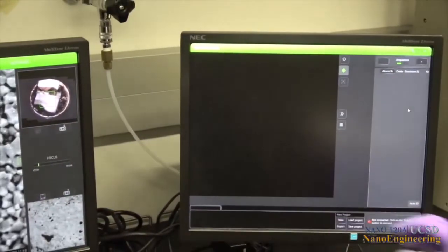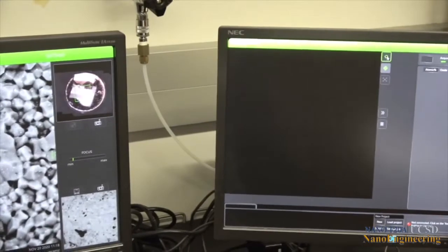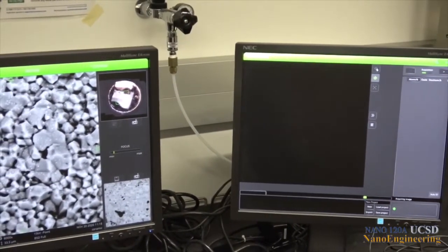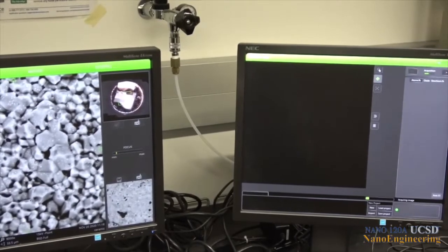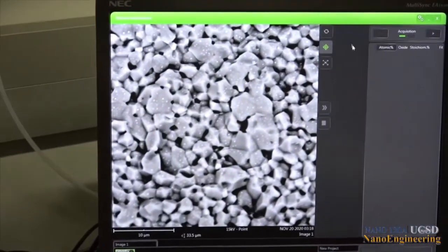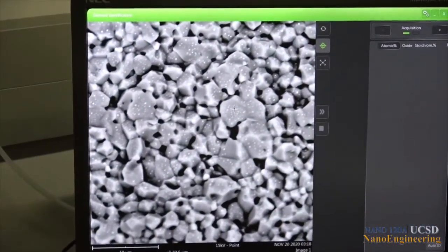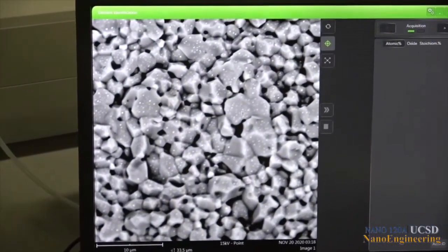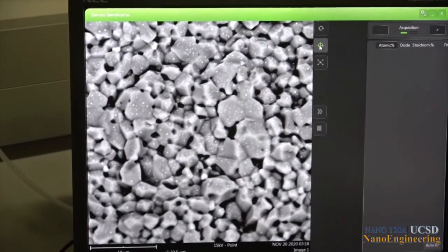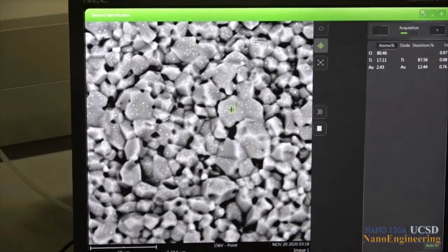To get the image on the screen for X-ray analysis, click on the refresh symbol at the top of the menu next to the image box on the right side screen. The image should then appear. We can then place our beam on certain features of interest for which we want chemical analysis by clicking on the target symbol shown and then clicking on the regions of interest in our sample where we want to target the beam. Note that the point is then labeled numerically in case we choose to do multiple points in an analysis over various regions of the sample. The analysis begins immediately as a list of the elements identified begin to show up on the screen.